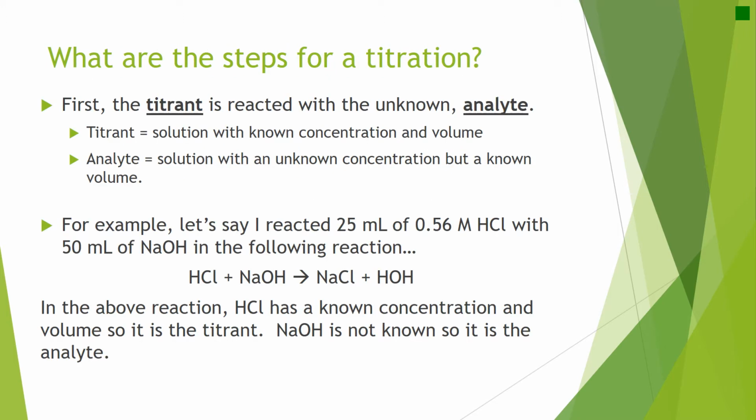The first one is that you're going to react a titrant with an analyte. What is the titrant? These are just two different vocabs you're 100% going to have to be able to identify. You're going to be using two different solutions, two different liquids. The titrant is the solution where you know the concentration and the volume. The analyte is what we are analyzing.